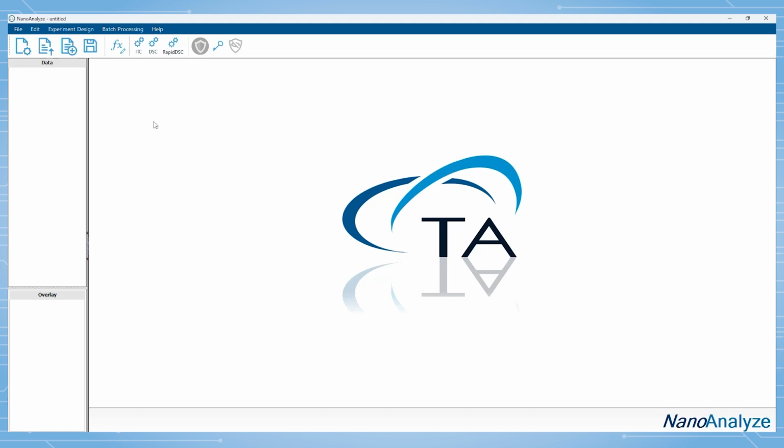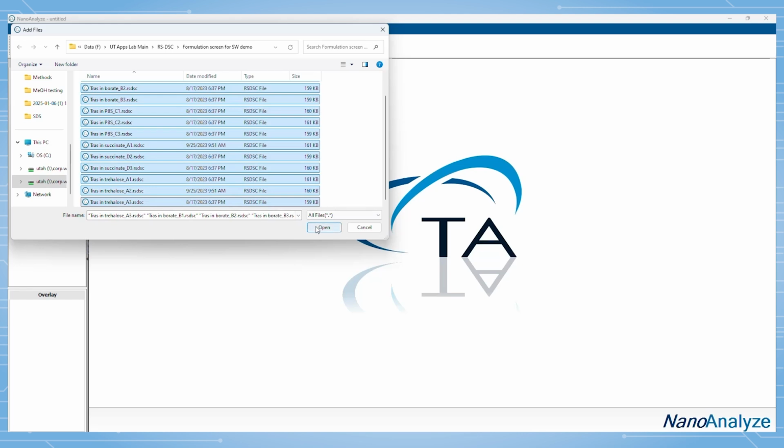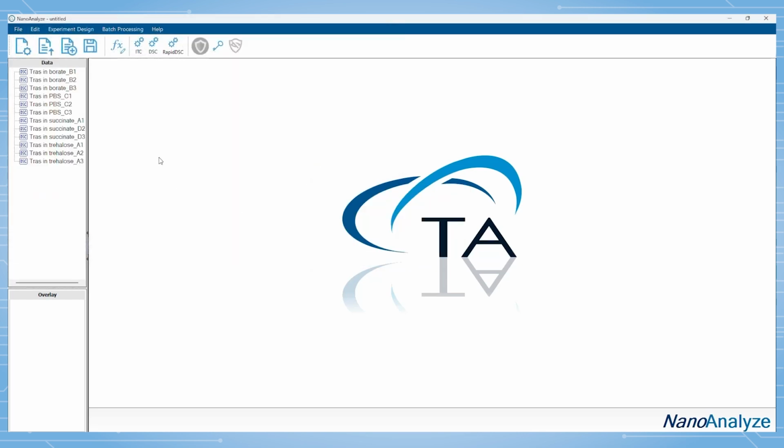In this tech tip, we will demonstrate how to use rapid analysis features in NanoAnalyze, including automated baseline detection and peak picking to rapidly analyze DSC data. Add data to NanoAnalyze by clicking File, Open, or the Open icon on the main screen. Select the desired DSC data files and click Open. The analysis described here will work for both NanoDSC and RSDSC data files.